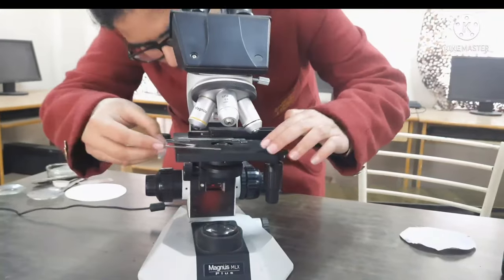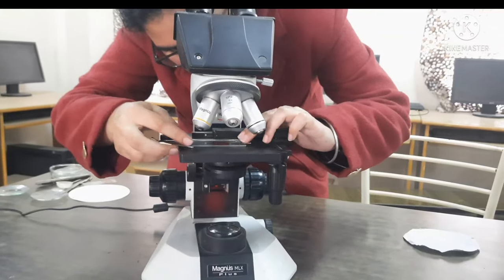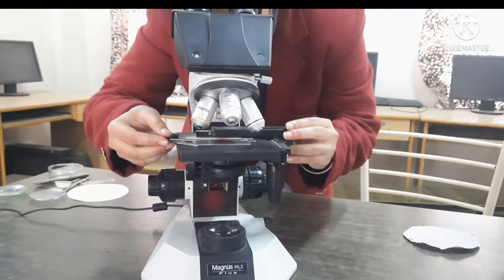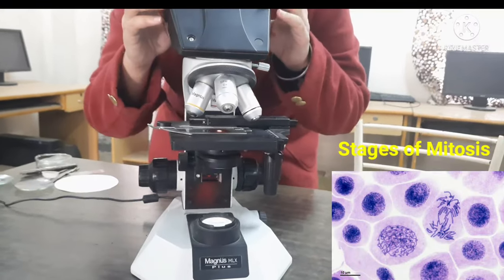Observe the slide under low power of the microscope to locate the dividing cells, then observe the different stages of mitosis under high power.